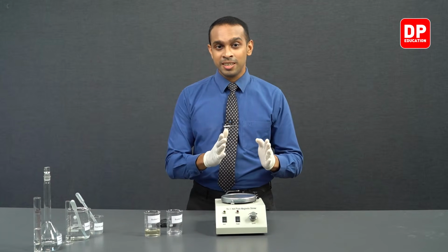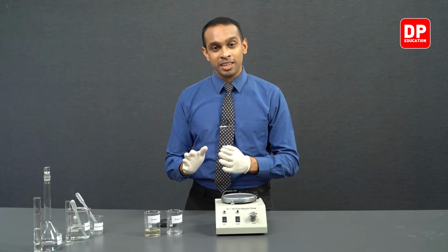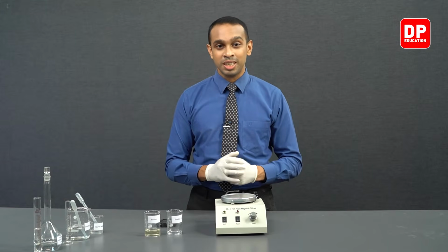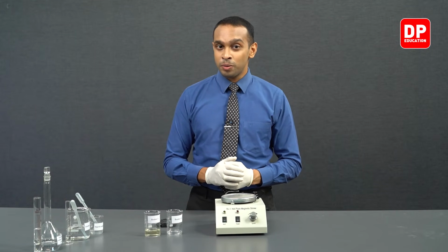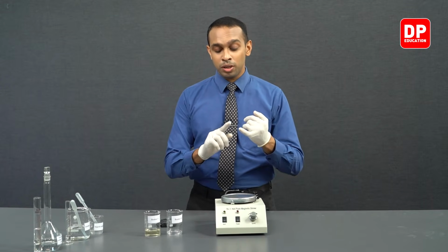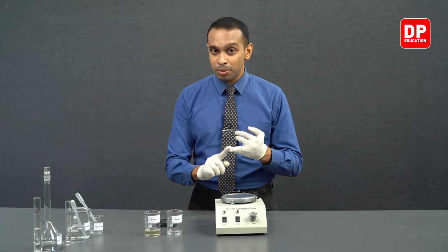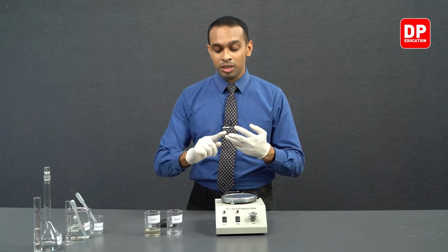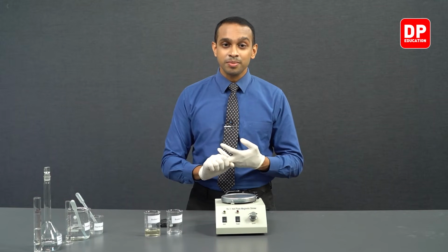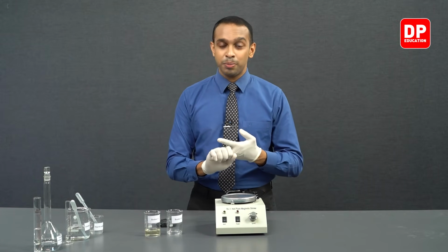So in this case, we are going to be changing the concentration of I minus by taking smaller and smaller volumes of I minus into the reaction mixture. We saw in the very first reaction of the first part of our experiment, we took 10 cubic centimeters of iodide ion solution, 25 cubic centimeters of Fe3 plus ion solution, and 15 cubic centimeters of our sodium thiosulfate solution. So there's no need to repeat that particular reaction.